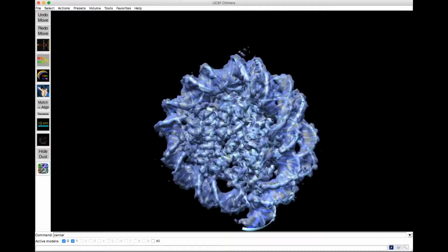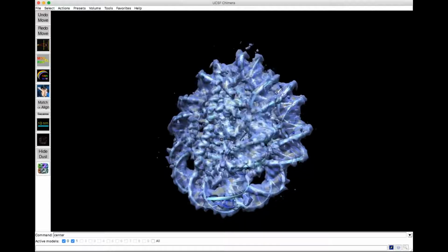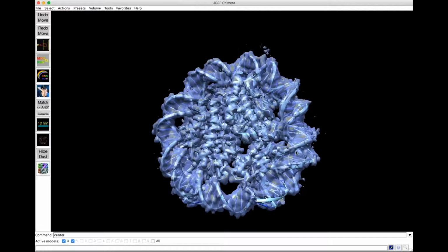So yeah, what's a good rule of thumb for atoms outside the contour being bad? Like 10%, 5%? Probably 10%. I mean, it depends on how reasonable your map is. So a lot of, like Jess's 50S ribosome structures, a lot of those proteins are just missing, and so you've got all these atoms outside, but the rest of it fit well.